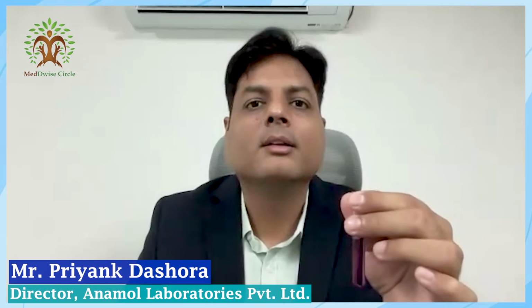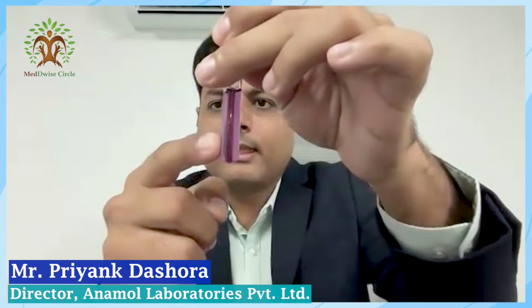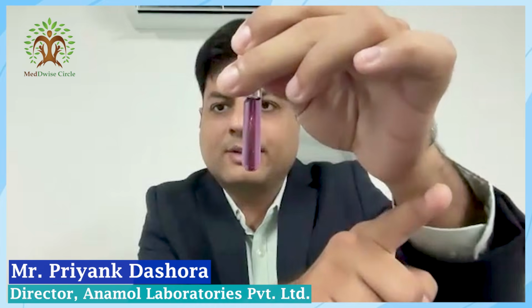There is also one more thing that determines how much light will be absorbed. This thing is called path length, which means that light will enter from this direction and exit from that direction.